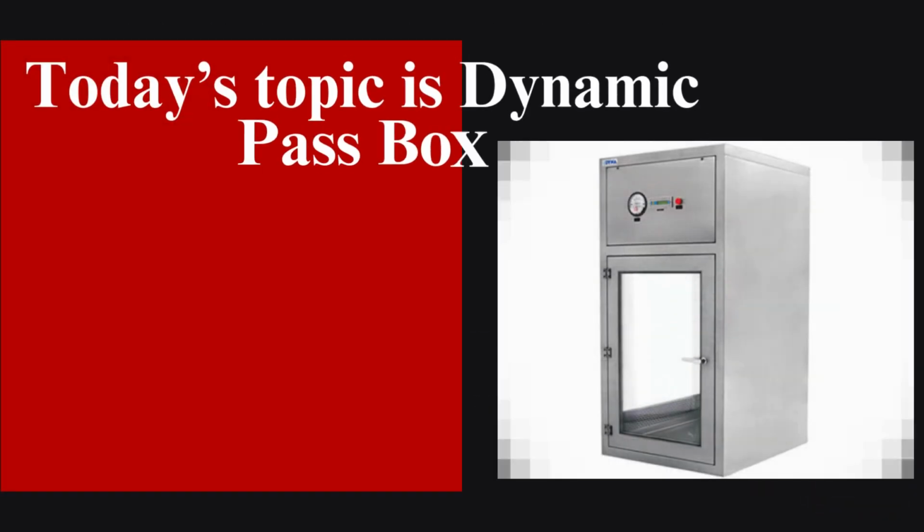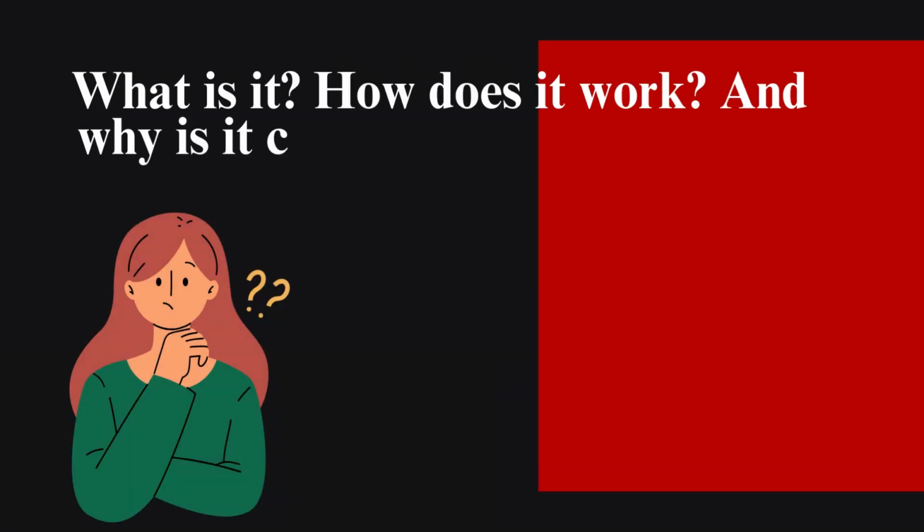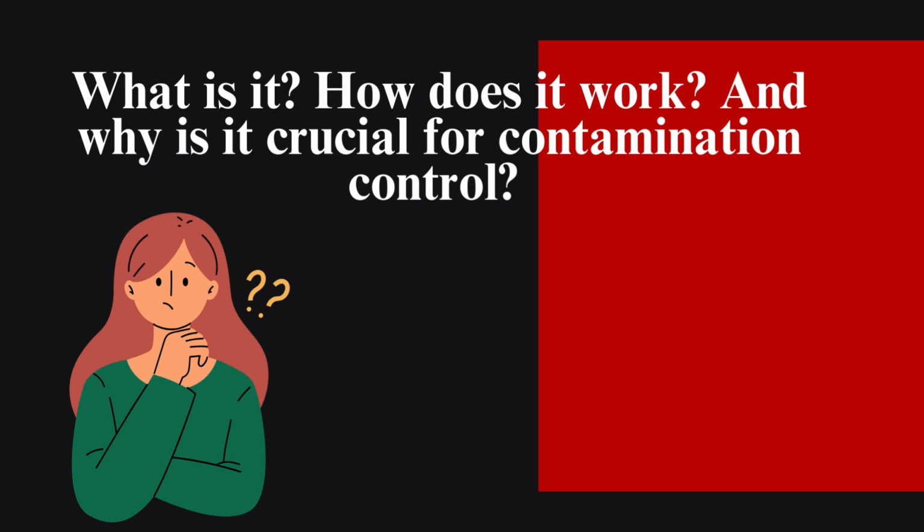Today's topic is dynamic passbox. What is it? How does it work? And why is it crucial for contamination control?